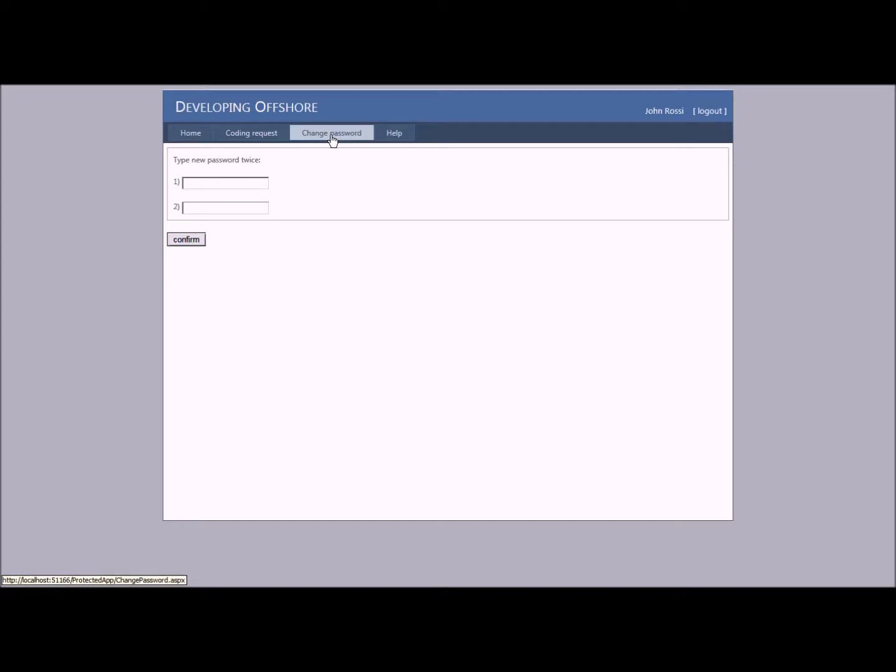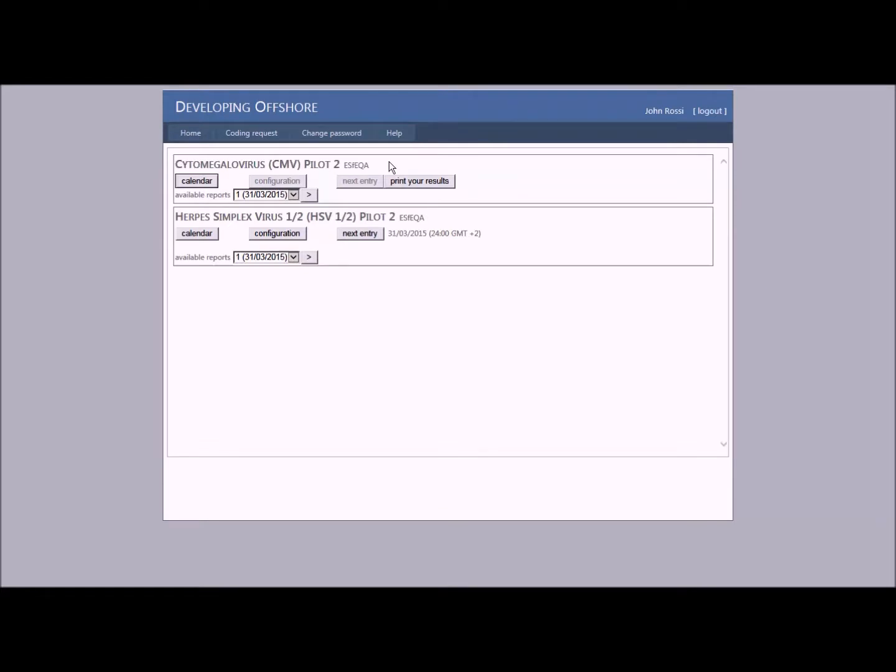You may download the manual of Teqa Lab by selecting Help, Manual Online. For complete information, please download our user manual.